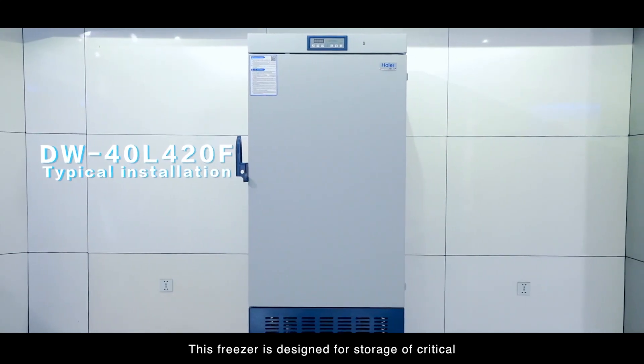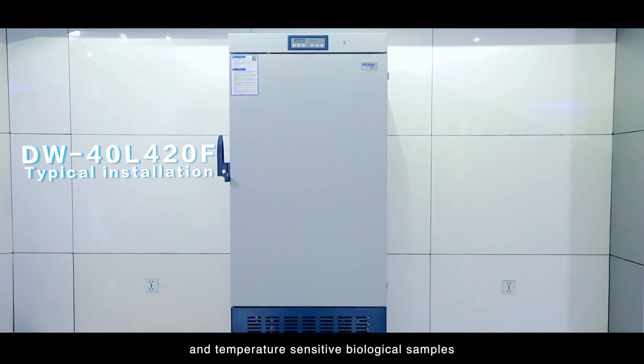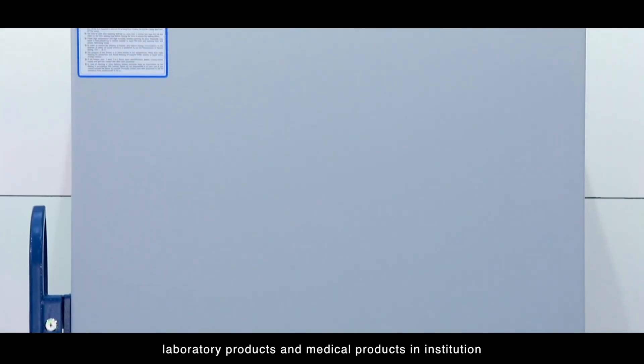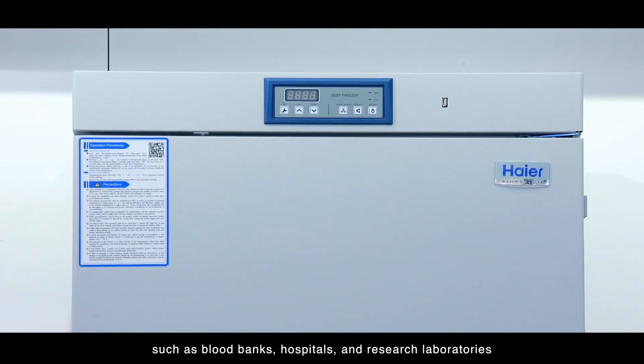This freezer is designed for storage of critical and temperature sensitive biological samples, laboratory products and medical products in institutions such as blood banks, hospitals and research laboratories.